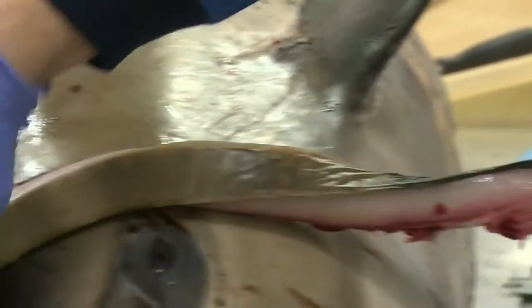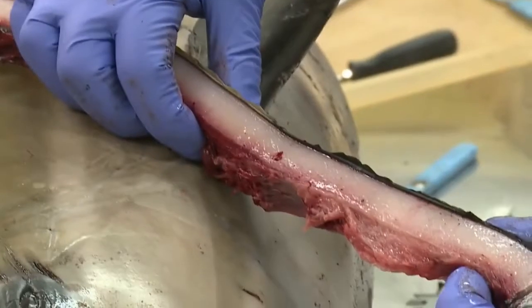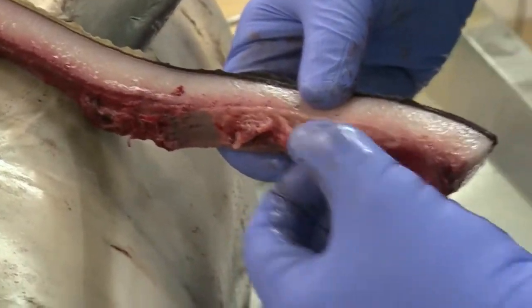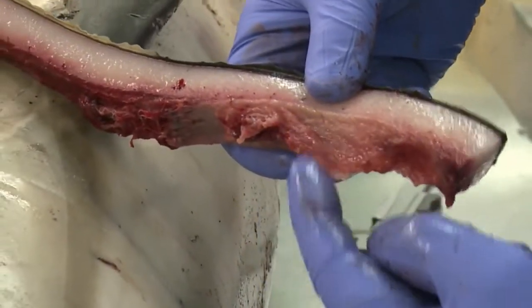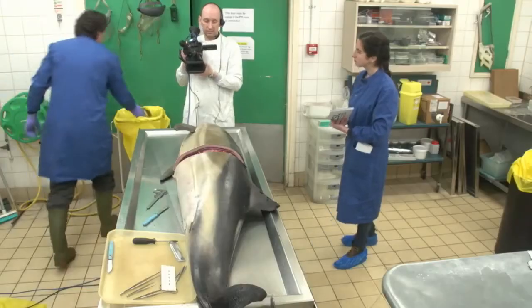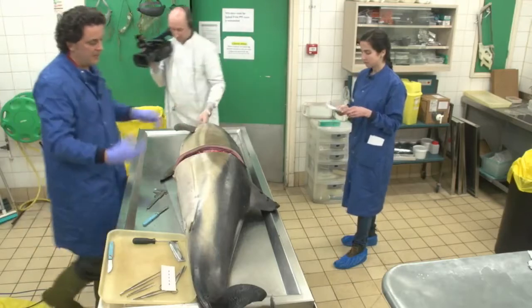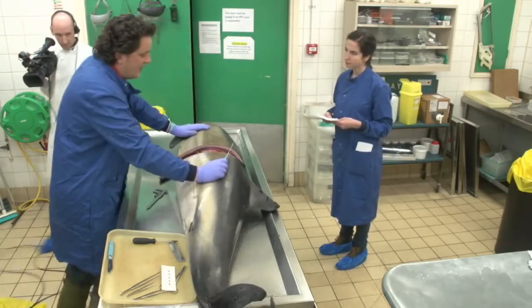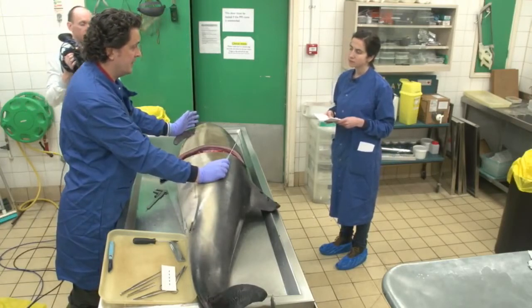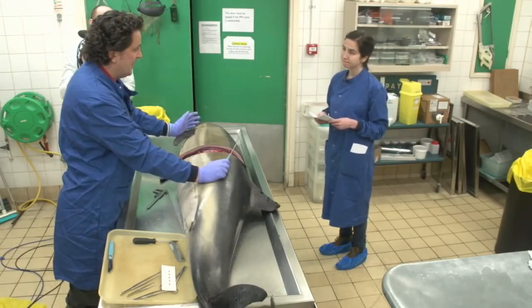What we can see from this, and I know from experience, is that's actually quite a good blubber layer, given the size of the animal and the time of year. And there's also some subcutaneous fat just here, which again, you'd only see in an animal that's otherwise healthy. So as we go through this post-mortem process, we'll build up a picture of this animal and what's going on. We'll talk through how that might relate to bycatch. So bycatch animals tend to be healthy. They're fat, healthy, feeding, and there's evidence of acute death. So that's a tick, I guess, for that first part of this.